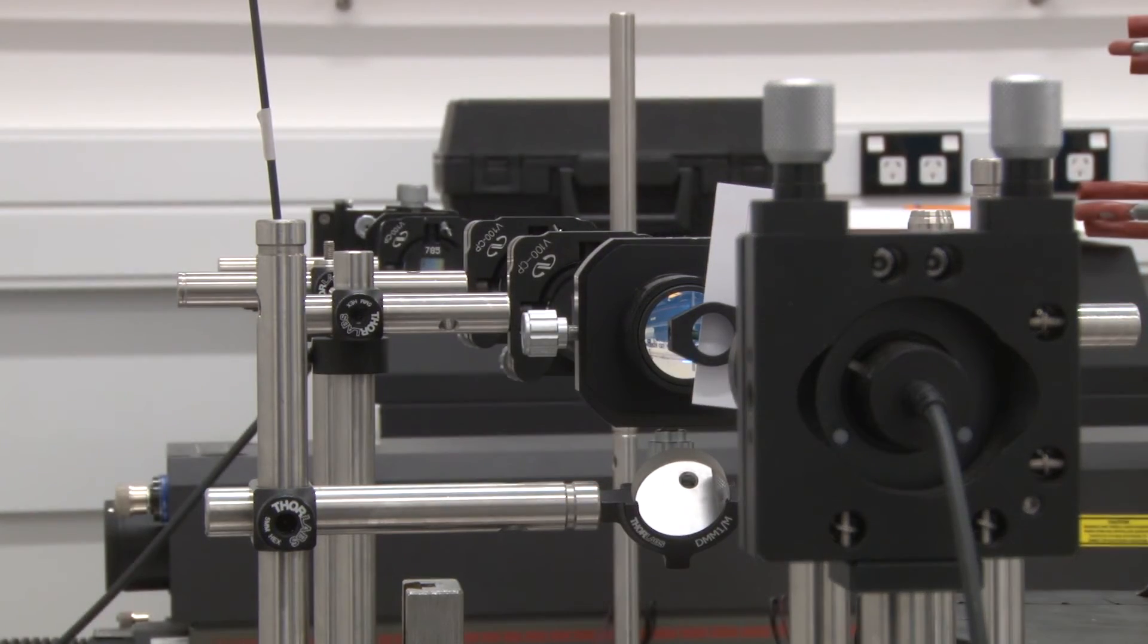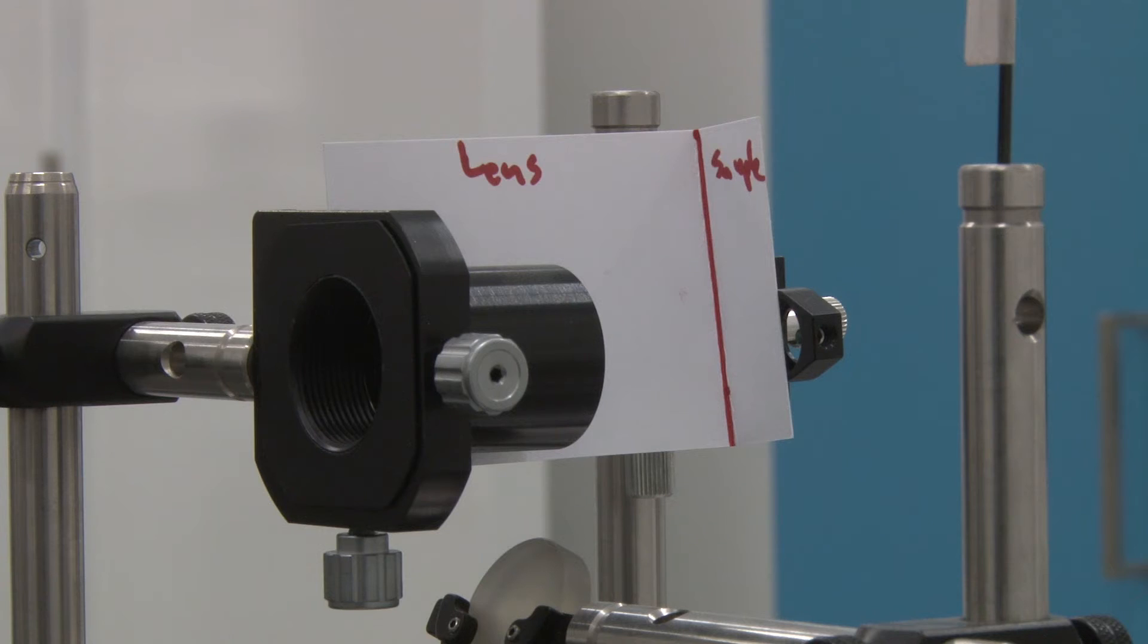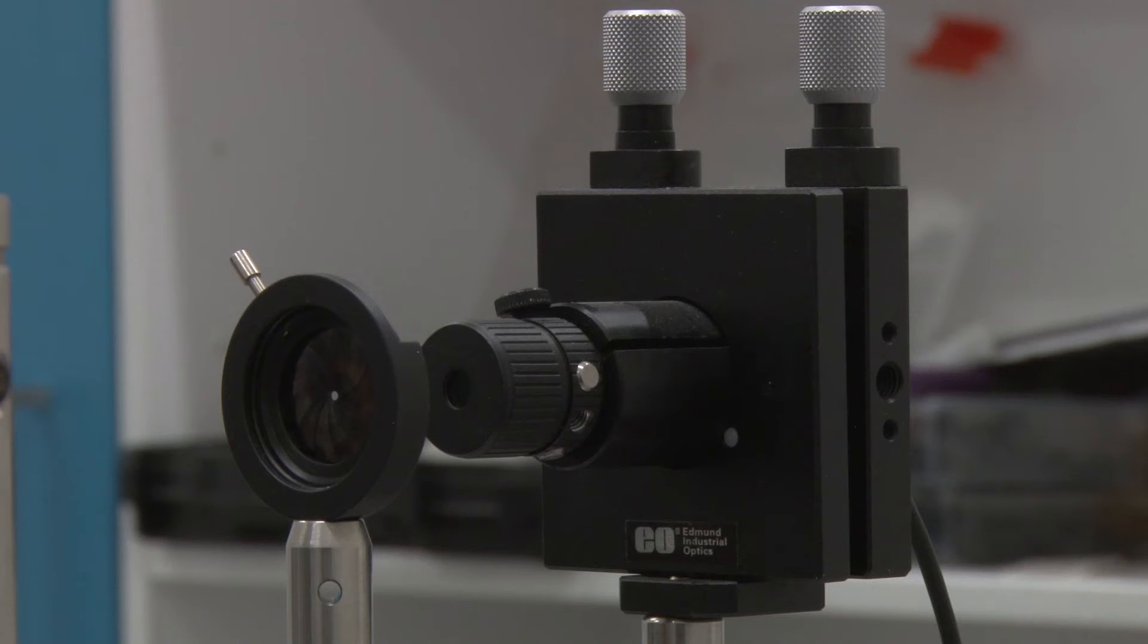And then over here we have another experiment. That experiment is constructed with certain optics in it that allow us to measure very low energy vibrations. They're called phonon modes.